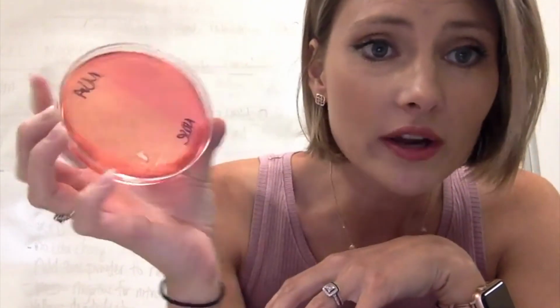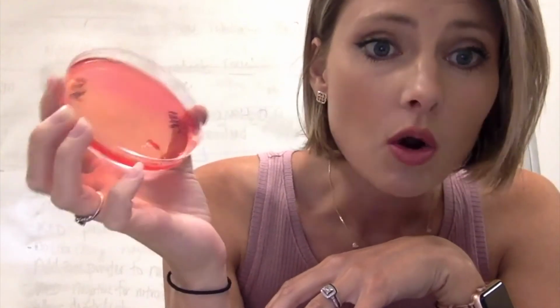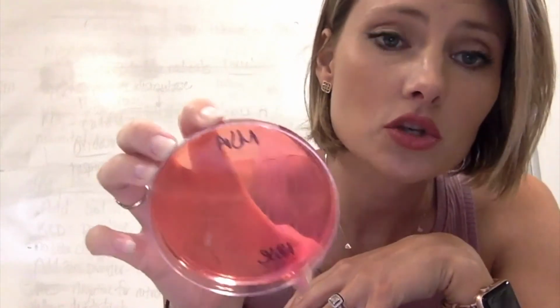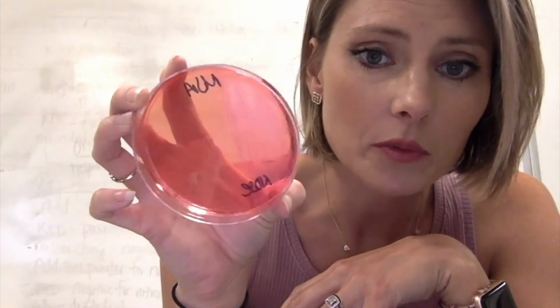Now, some people are carriers of staph. So if you've ever had a staph infection before, or you're simply a carrier, sometimes we do actually get yellow plates from the nose swabs. Unfortunately, we didn't get to do that. That's usually a fun exercise. Everybody gets to see what's living in their nose and throat, but we didn't get to do that.